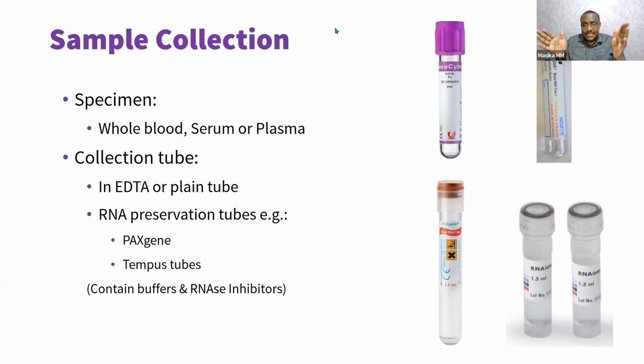So when we melt at 96 degrees Celsius, even the primers will detach, they will be denatured. Well, not when we anneal, when we denature at 96 degrees Celsius, the primers will detach. When we bring it back down, maybe to 60 degrees Celsius, the primers will attach again. And now they're attaching to whatever template is available.